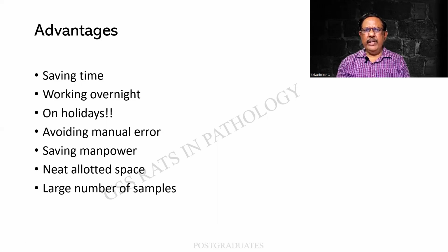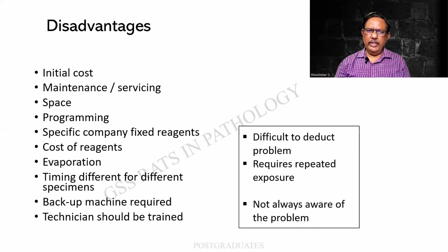Whenever I say advantage, there will be a disadvantage also. For example, the initial cost is going to be exorbitant. It will be running into several lakhs. And here again, we feel that the foreign instruments are better than the Indian instruments because of the precision.